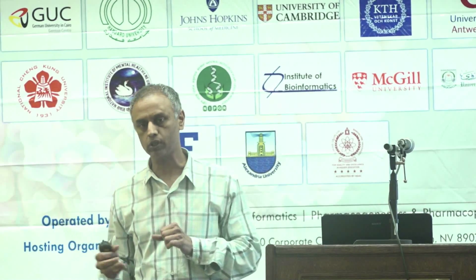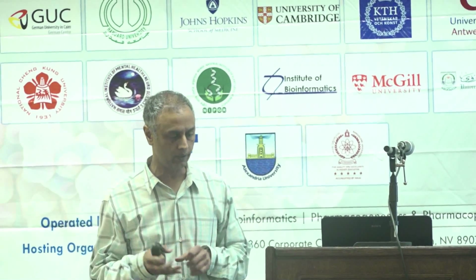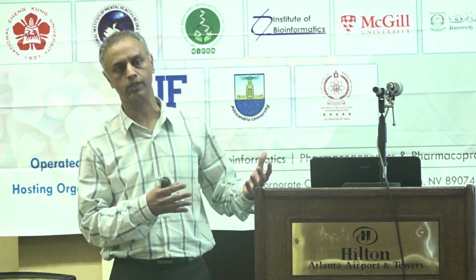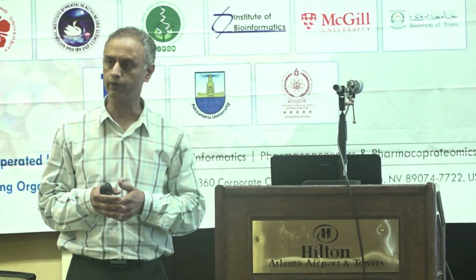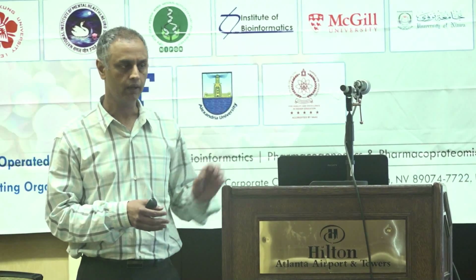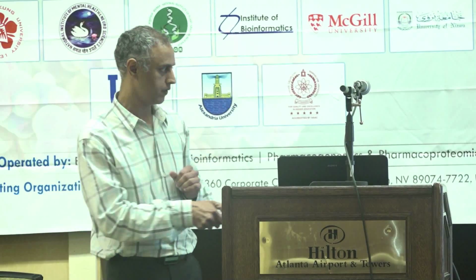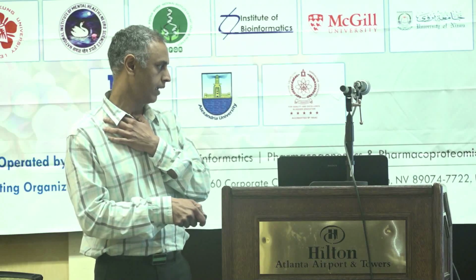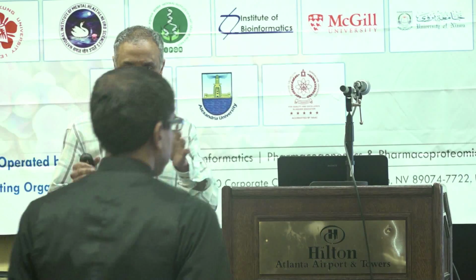This is actually not possible today in most of the other types of proteomics, where we argue about whether a phosphorylation site was real, whether a peptide was identified. Here, we are actually saying, in a clinical setting, this is identified. So that ease of use is there for the clinician. It's considered definitive. That's one take on it.